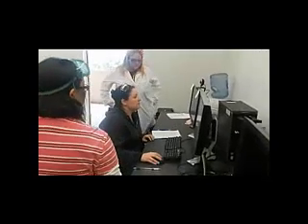Okay, so now I'm going to walk you through, so you can set it up. Can you set all the queues up at once? That's what we're about to do.